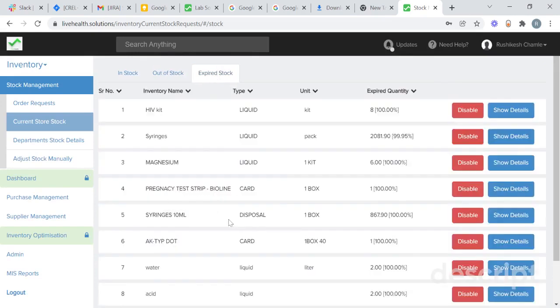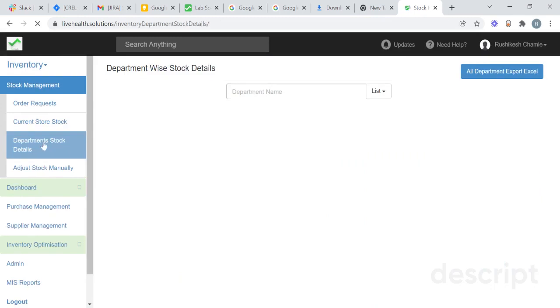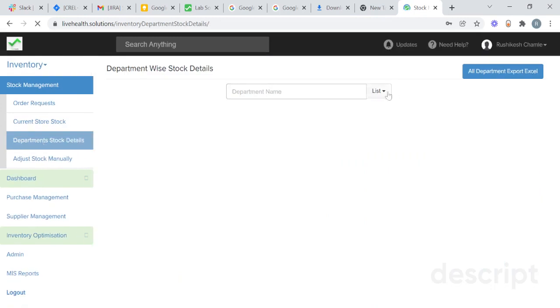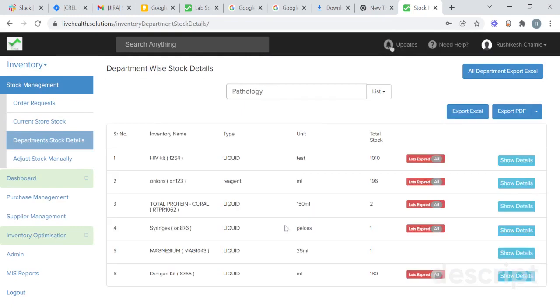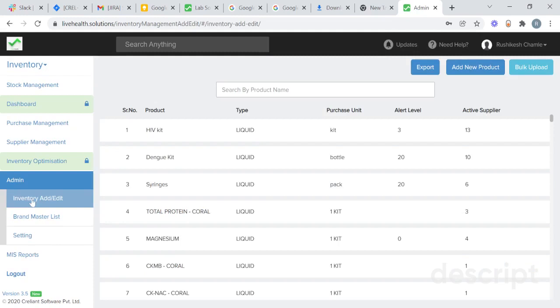In expiry stock, you will get details of the stock which has been expired. In department stock details, you will get details of the stock from a particular department. Click on the department which you want to see. Suppose I want to get details of the pathology lab — click on pathology, and here you will get details of the stocks from pathology.